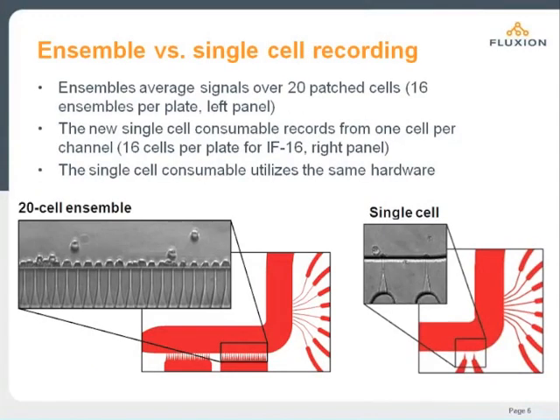To get your bearings on this slide, shown in red is a close-up of the region where the traps meet the main flow channel from the previous slide. The inverted L shape is the main flow channel. The inlet would be in the upper right, the traps below, and the outlet off to the left. The 8 lines coming into the main flow channel are the inlet lines from the C1 to C8.